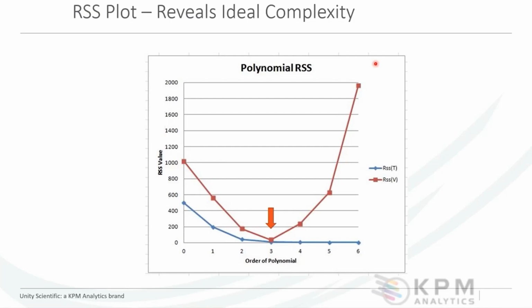So that was a quick explanation of data analytics. There are some key parts to this. What I really hope all of you can take away from this is to understand a feature extraction technique: how we are taking these hundreds and hundreds of data points in an extremely complex mathematical problem, mathematically reducing it, and focusing on the areas of the spectra that demonstrate variance. Then we use this mathematically reduced spectra and this demonstrated variance in our regressions going forward to create our NIR calibrations.